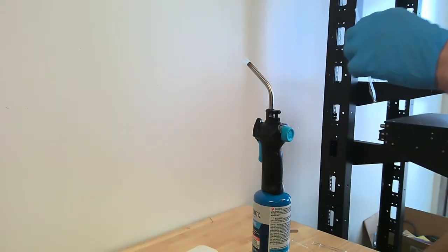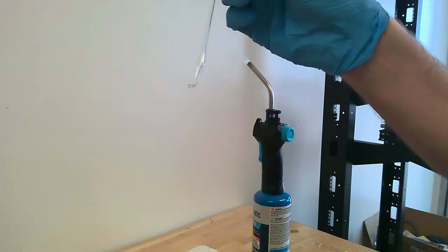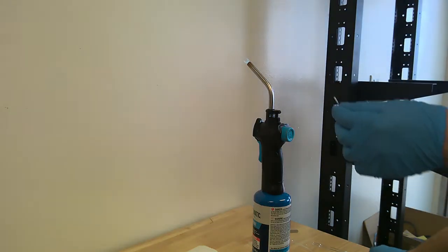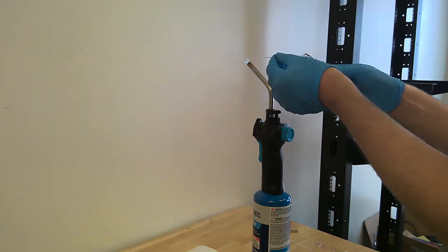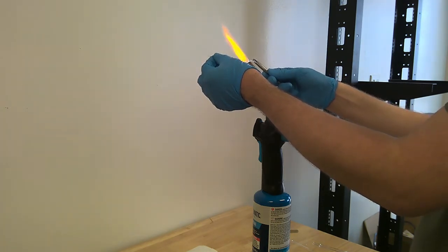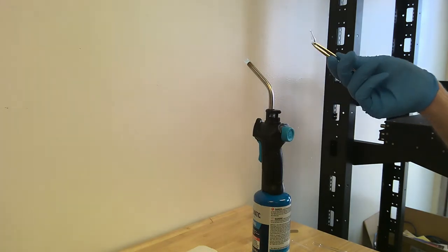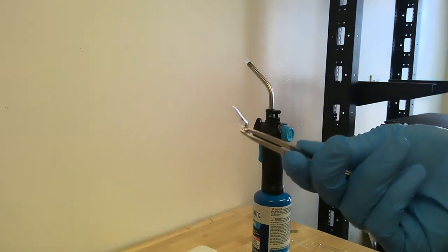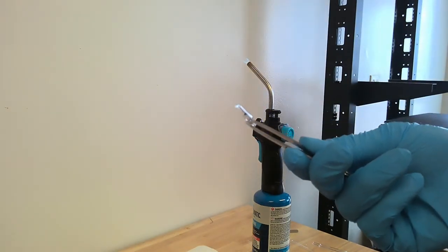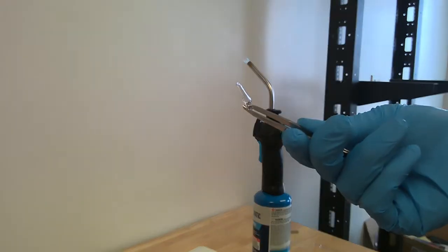Okay, now that our bottom's sealed off, we're going to trim and taper off the bottom in a second step once it's cooled. We're also going to taper off the top of our picnometer, holding it on one side with our tweezers. We're going to very carefully pull off the top portion, and now we're going to taper off and smooth both ends to get a complete picnometer. This is a relatively large picnometer, and I can show you an example where we pull an even smaller picnometer towards the end of today's session.